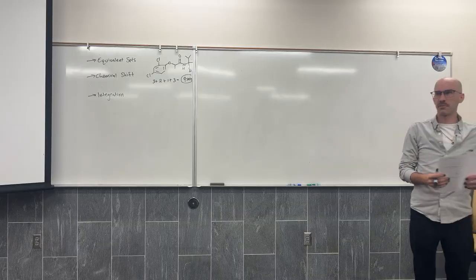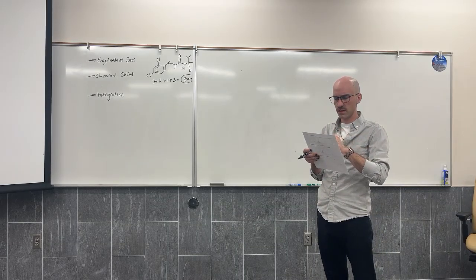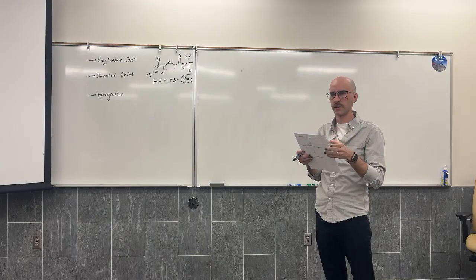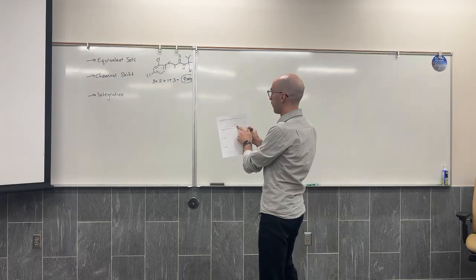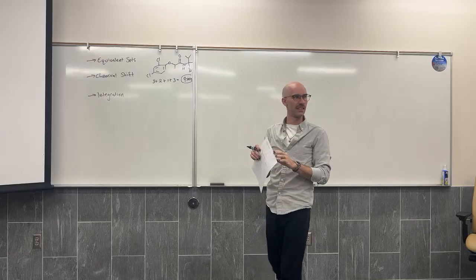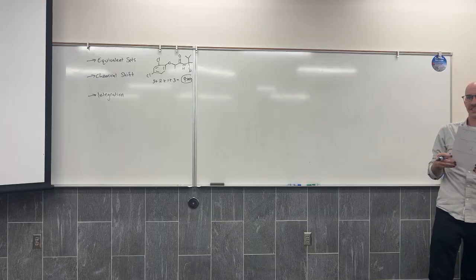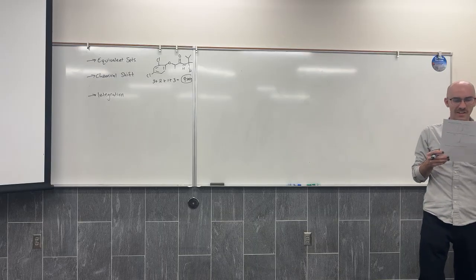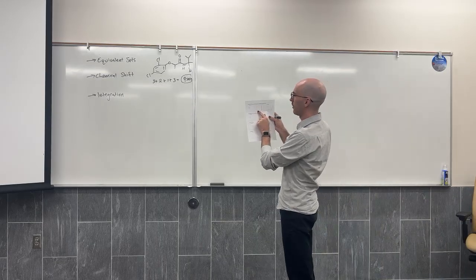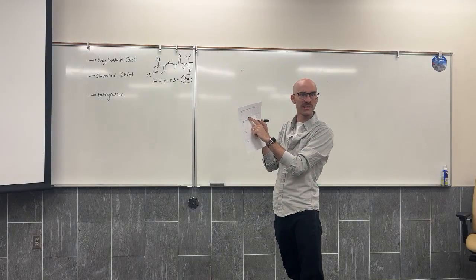And then we looked at the NMR spectrum for it. I feel like yesterday we thought there were maybe 8 sets. 1, 2, 3, 4, 5, 6, 7, 8, 9. Okay. And on the NMR spectrum, we saw 1, 2, 3, 4, 5, 6, 7 signals, give or take, because some of these signals are a little hard to identify. Like this one that's just before 7, it kind of looks like it has a shoulder on the left-hand side. Is that a separate signal?